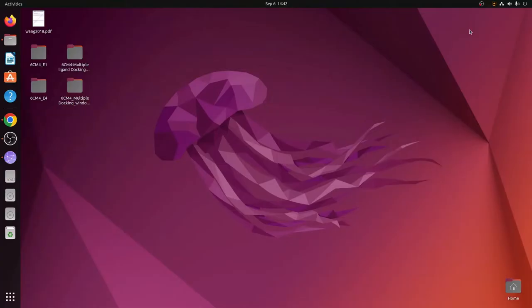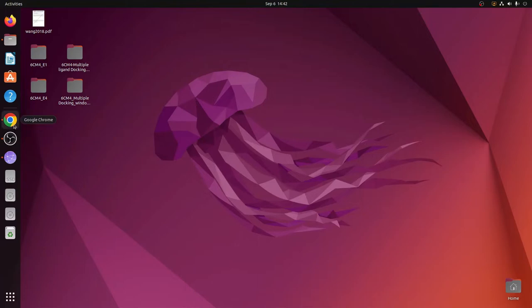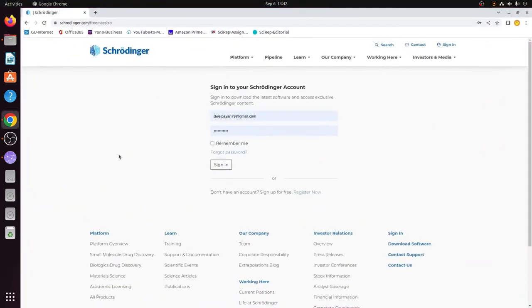Welcome to my another video. In this video I will explain how to properly and correctly install and then uninstall the Schrodinger free version of Maestro for academics. To do that, the first thing we need to do is to go to a web browser and in the address bar you just go to this address.